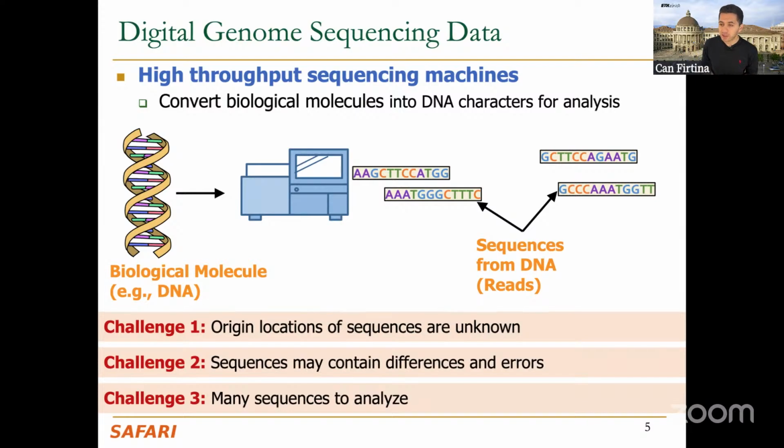It is not necessarily the case that we are sequencing the entire genome just once. We are sequencing it multiple times. It's done either by copying the same information multiple times with amplification, or essentially using multiple cells. But essentially what we will generate is usually multi-copy information of your genome. And assume we cover your genome 10 times, meaning from a single parent, we generate 30 billion bases. Then this means that we have 10x sequencing depth of coverage.